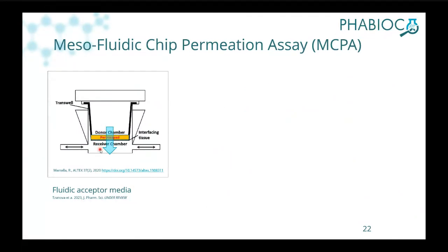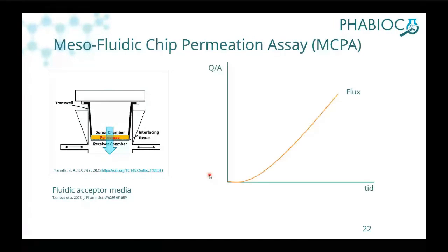From the acceptor, from the donor side, and also we can stir in the donor media, so reducing the unstirred water layer effect that in some cases affects the permeation. And through this system, we actually could investigate different solid dosage forms and try to interpret the permeability, which of this formulation could have been the most promising to carry forward.